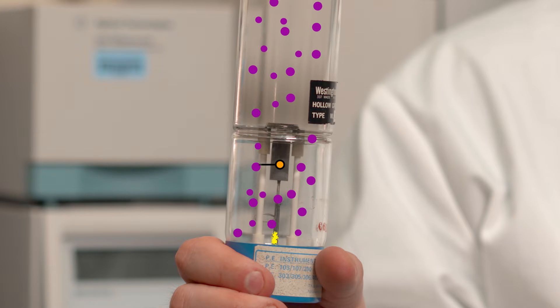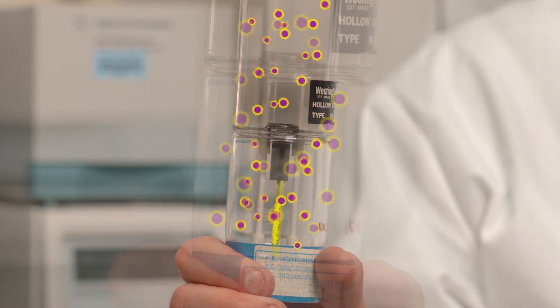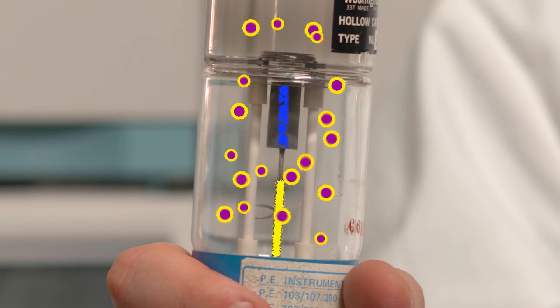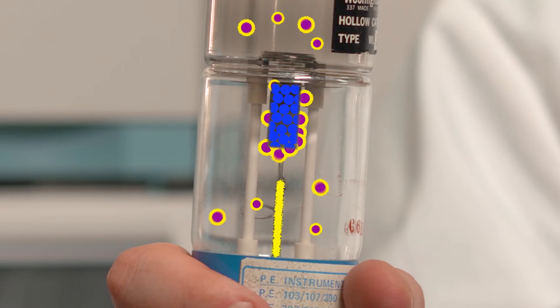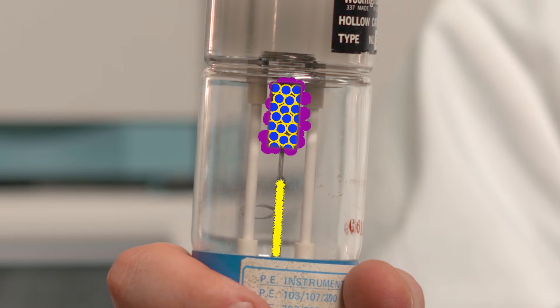When electrical current is passed through the lamp, energy from the electrical current passes into the neon atoms. The neon atoms get very excited and move quickly around the lamp. Eventually, the excited neon atoms will collide with the calcium in the middle of the bulb. The neon atoms then transfer their energy into the calcium, and the calcium gets excited.